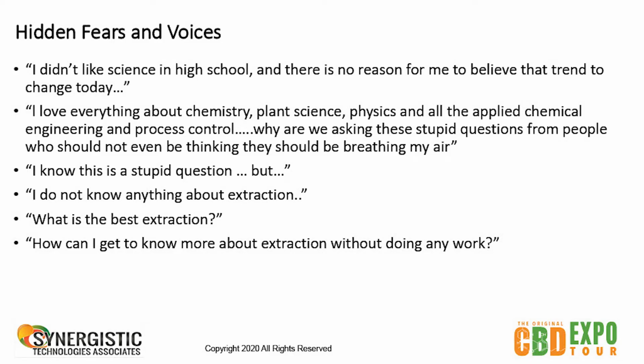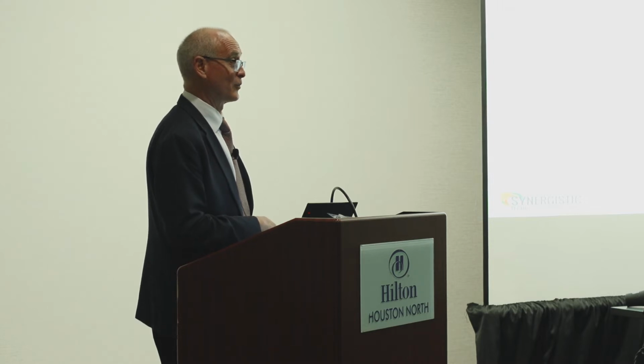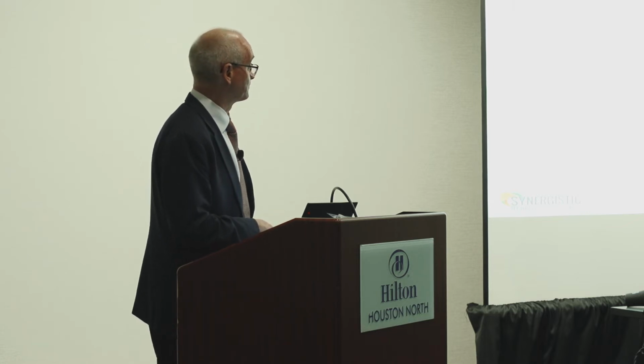What is the best extraction? We'll answer that one too. I have a few things to help on what the best extraction is, as well as when you're looking at extraction, when you're doing sample preparation for doing a qualitative, that is extraction.